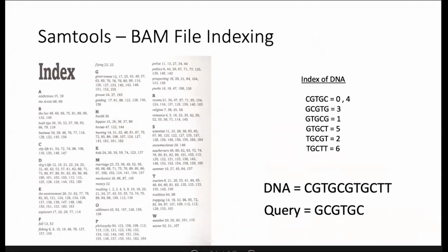When we want to know where a sequence or read aligns to, we query the index using a 5-mer from that sequence. So we would take a 5-mer from this string, which would be equivalent to a read that was found within our file, and query the index that was created.